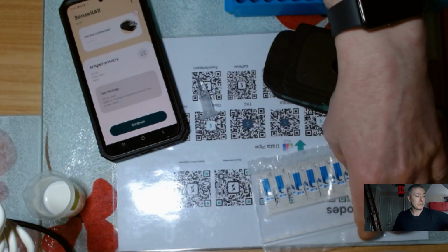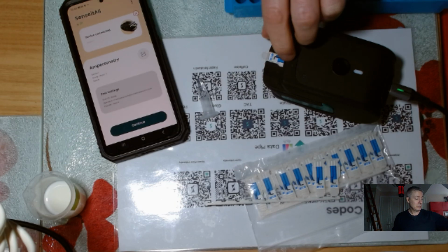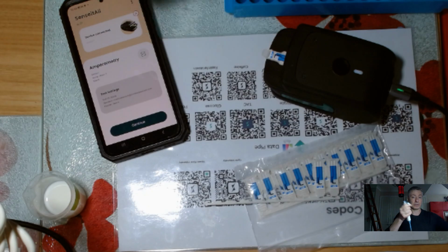Now that effectively forms about 21,200 ppm of that solution. What I'm going to do is grab 100 microliters of that solution. It's hard to keep track of all the things that are going on in front of me, but I'm going to grab 100 microliters of that, because don't forget this is very concentrated now.